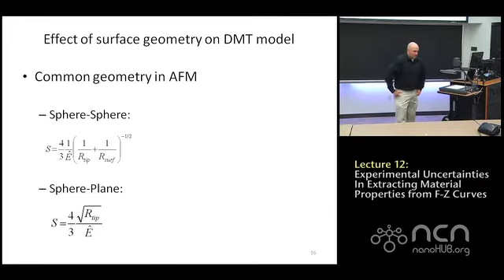In my case, I'm always interested in small indentations. When I say small indentation, I mean that the contact area is small relative to the critical dimensions of whatever you're indenting. In cases where this is not so, which is especially true in nanoindentation, they often use the Sneddon approach. You have larger forces, so the adhesive forces are no longer so important, and you go back to Hertz.